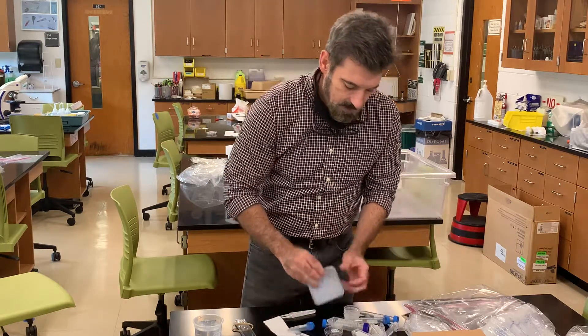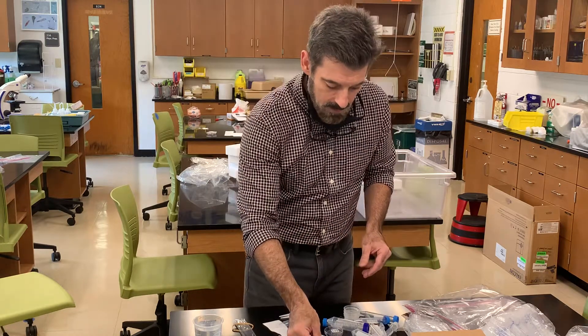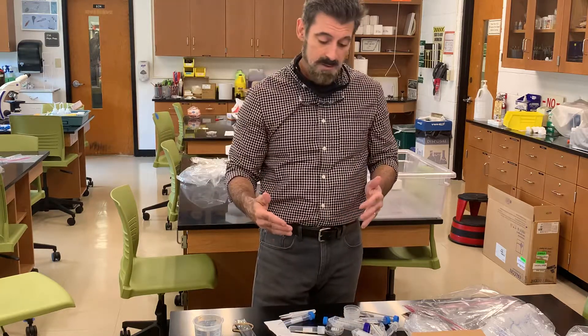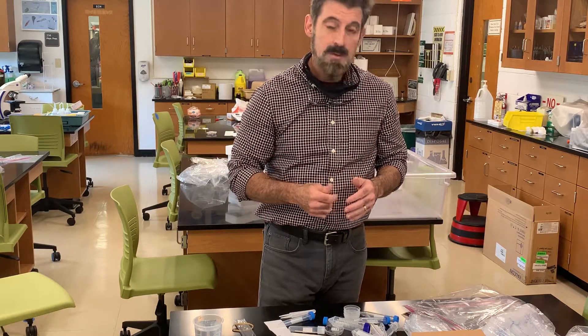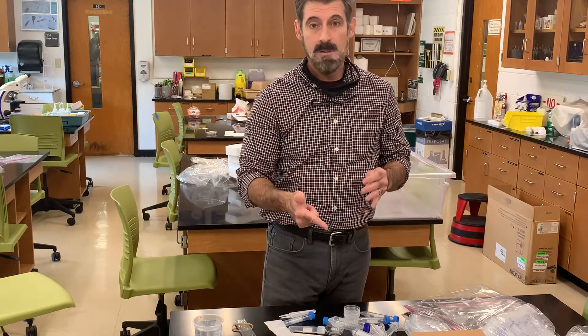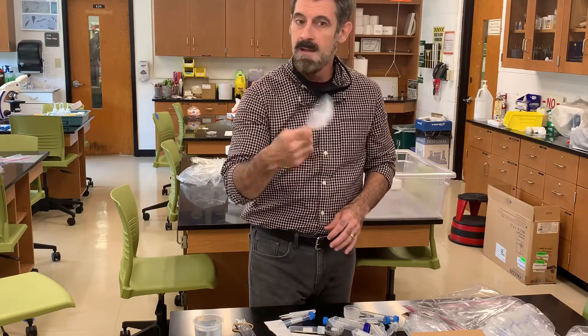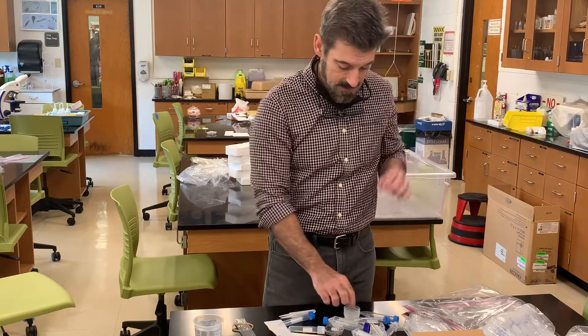What you'll need is a weigh boat — a little plastic weigh boat that goes on the balance. I'll show you how to use it in that specific video. You can weigh water in this lab, or weigh salt, sugar, and other things you'll use in other labs. You'll be able to use this weigh boat over and over again; if it gets dirty, just clean it out.